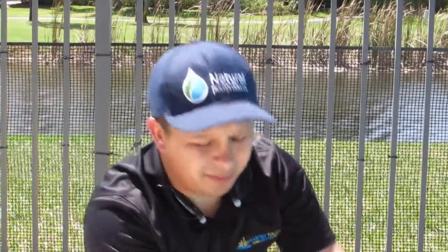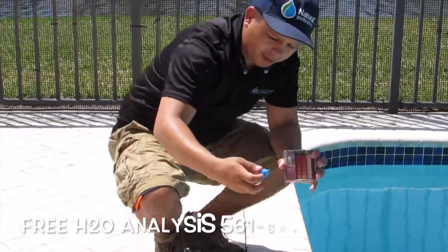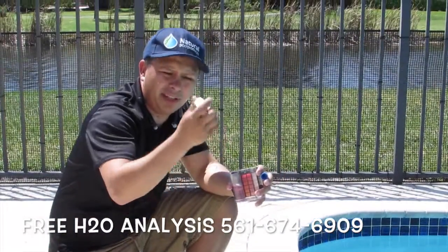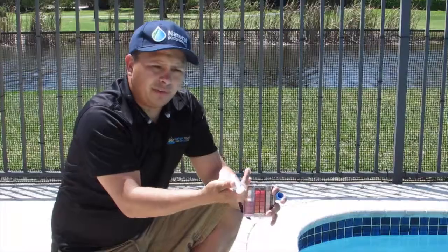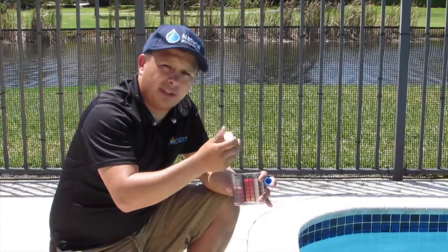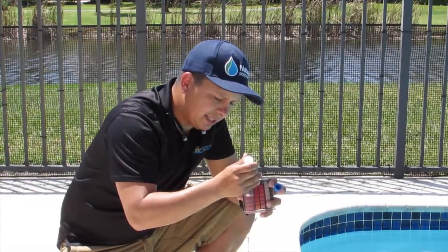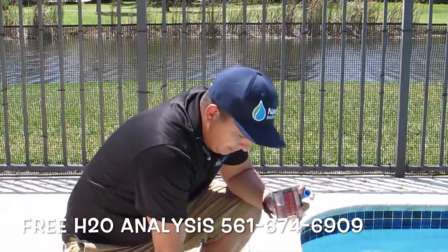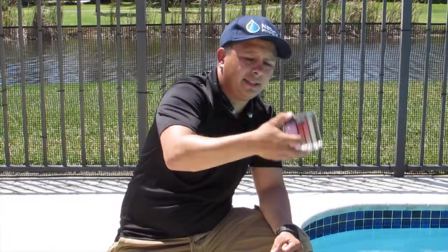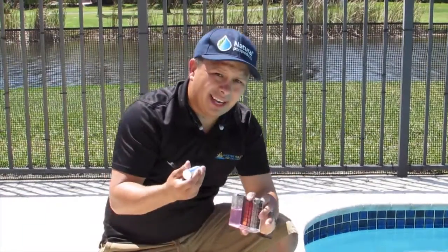I don't know if you guys can see it in the video. Now we're going to get the R12. Calcium is supposed to be anywhere between 300 and 400 parts per million. Each drop represents 10. I know this pool for sure is not going to be less than 200, so I'm going to drop at least 10 instead of doing 1 by 1 to save us time. And you shake it — as you guys can see, color did not change, it's still pink. I'm going to probably add another 5 more.